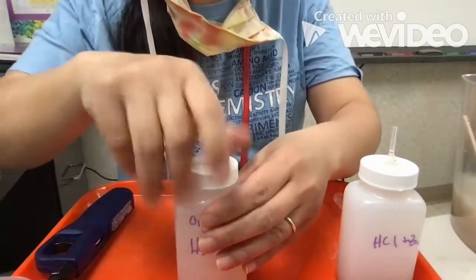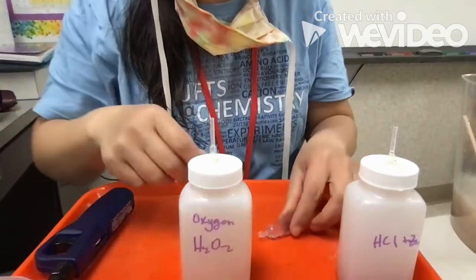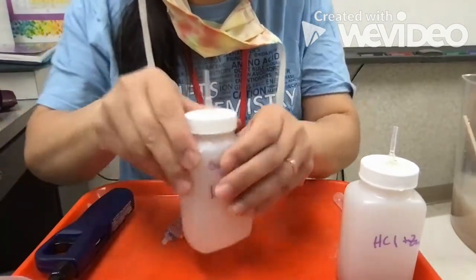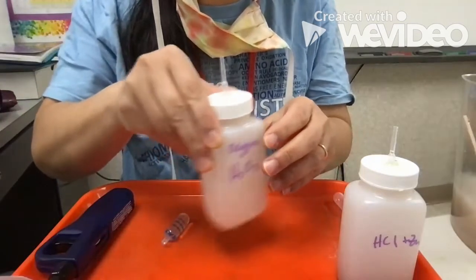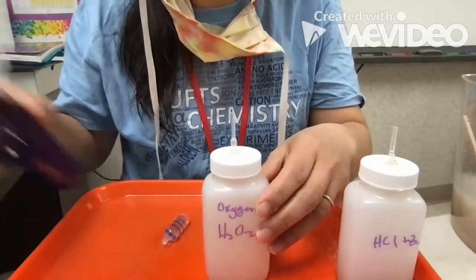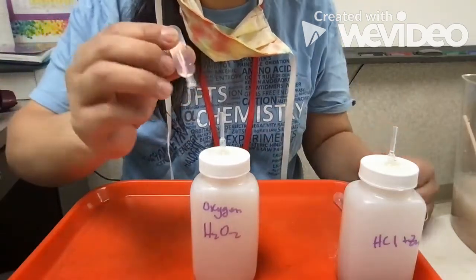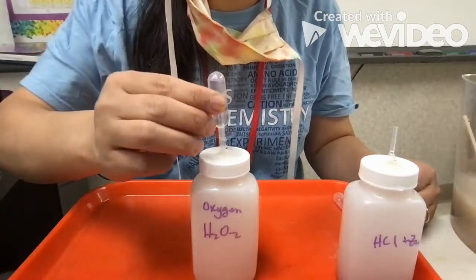Okay, put our top on. And again, here we're going to let it sit for a bit, mix it up. Okay, make sure it's reacting. And then take your micromole rocket, put it on the oxygen generator.